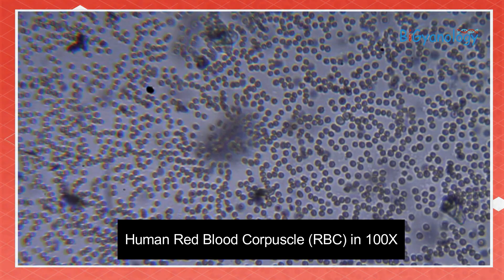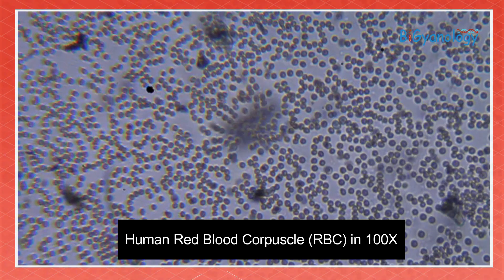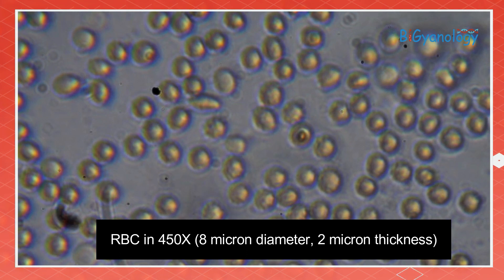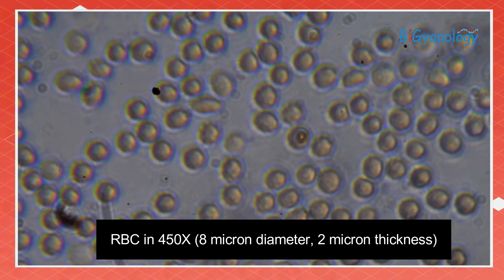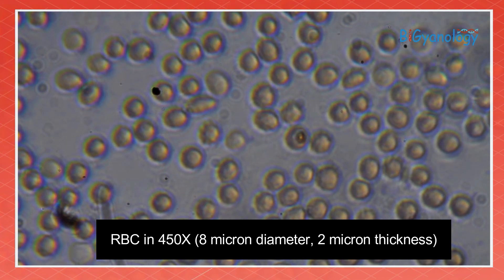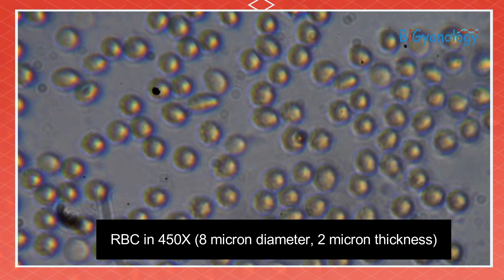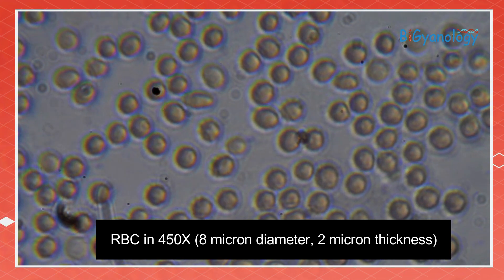I am using a digital device so that you can see whatever I can see. You can see the RBC here — this is 0.9% NaCl normal saline, where the RBC shape remains the same. I am changing it to high power. This is the shape of RBC in 0.9% NaCl, which is considered to have the same ionic concentration as blood, so the shape remains the same.